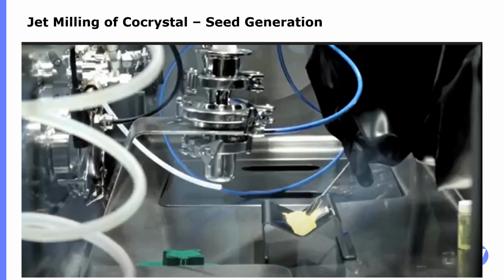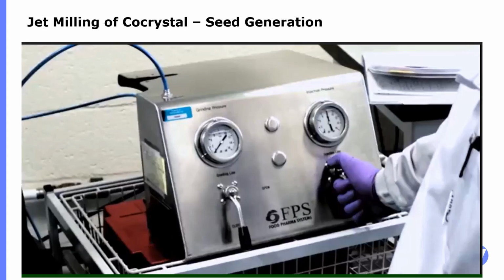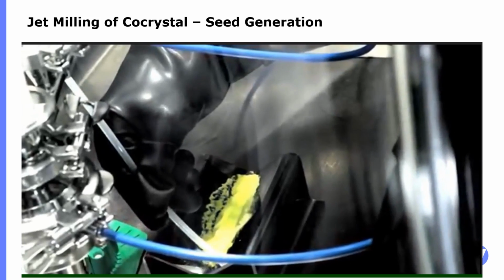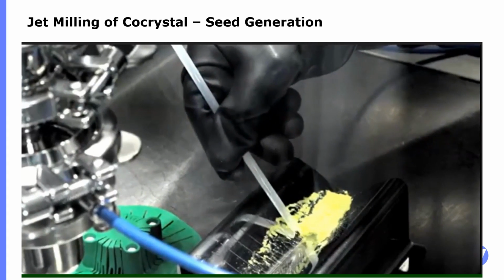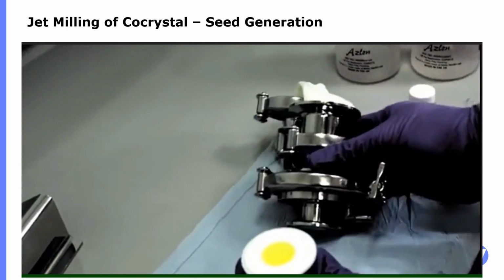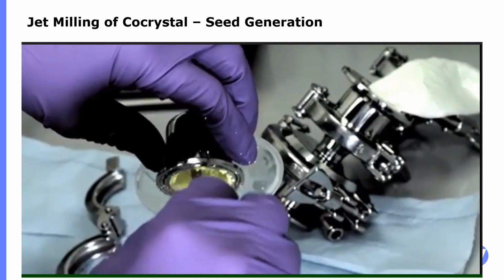So in this slide, I'm going to describe how jet milling works. The material is fed into a chamber where high pressure nitrogen jets cause collisions between particles, which fracture, giving a reduction in particle size. So this process is solvent-free. Milling operations are known to generate fine dust, an explosive hazard, so we operate in an isolator under a nitrogen atmosphere. And we have controls such as feed rate to the mill and grinding gas pressure to tune particle size further if needed.